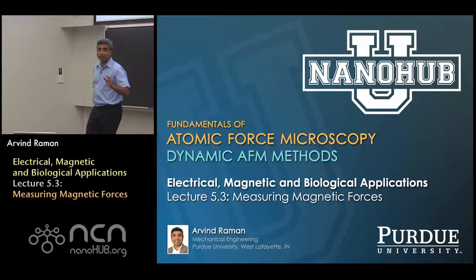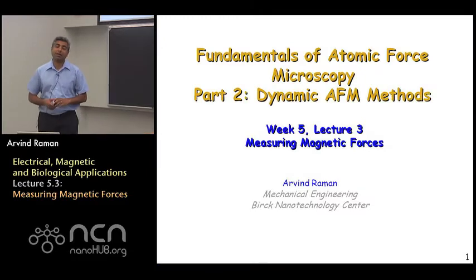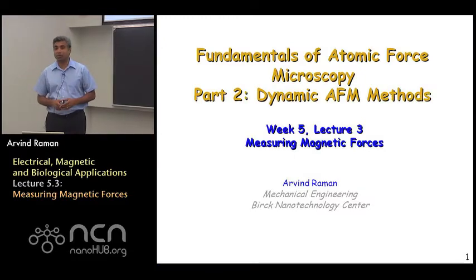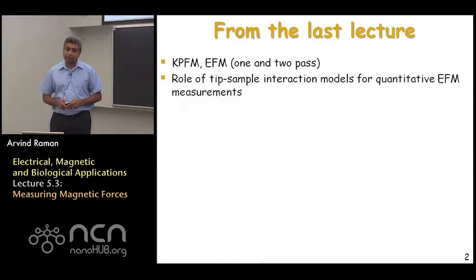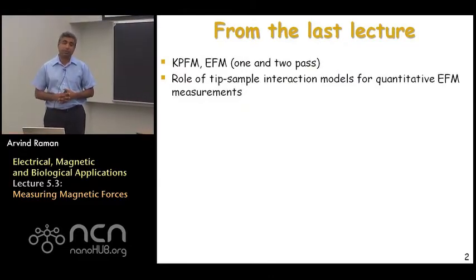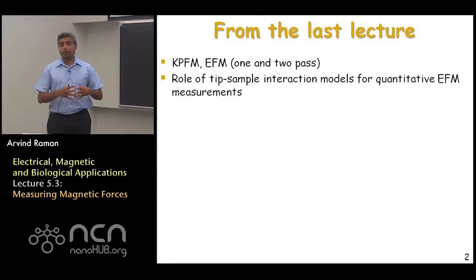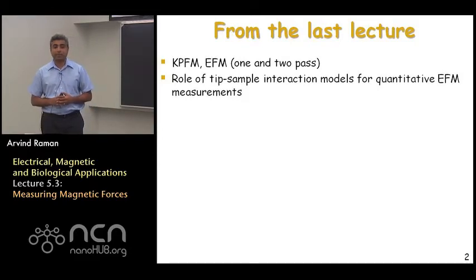nanoHUB-U, online instruction. Hi, and welcome back to Lecture 3 of Dynamic Atomic Force Microscopy Methods. In the last class we were talking about how to measure electrostatic forces using dynamic AFM methods. In particular, we talked last time about the fact that you can go beyond Kelvin probe force microscopy and use single pass and two pass electrostatic force microscopy techniques.